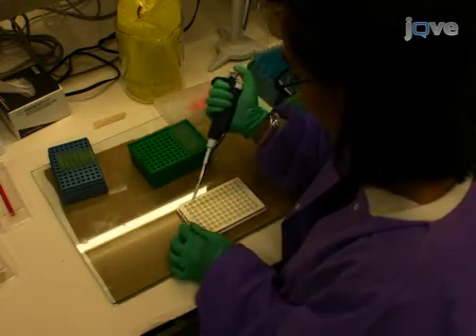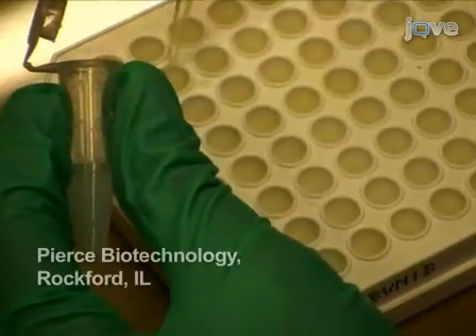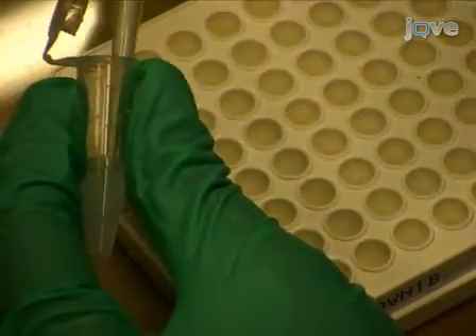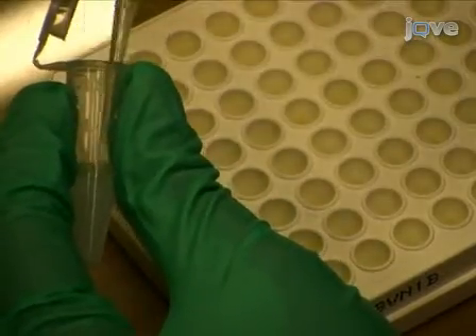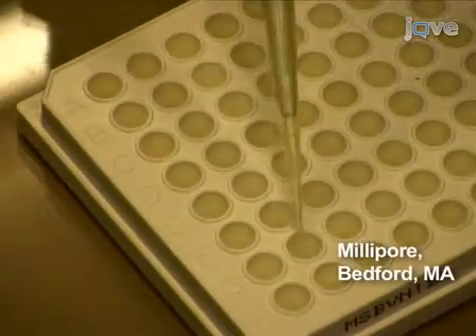During the incubation, retrieve a 1.5 mL aliquot of a 30% Ultralink protein A/G bead suspension in PBS from the fridge. Add 5 µL to the bottom of each well of a new 96-well filter HTS plate.